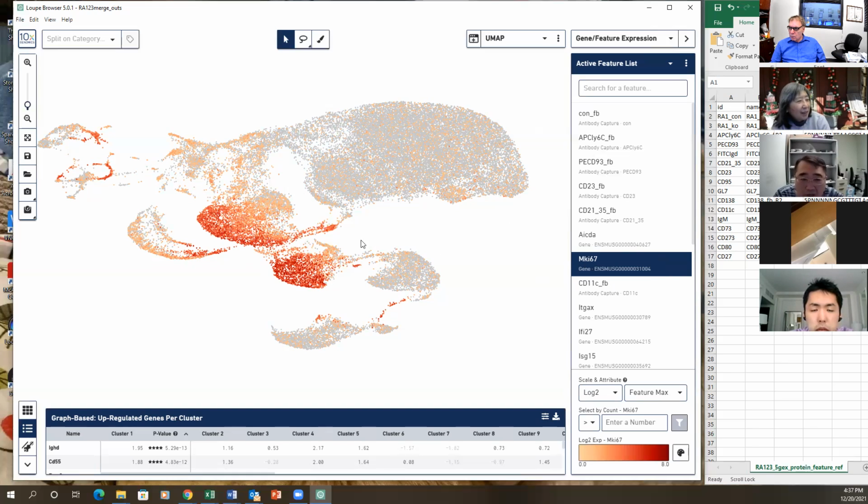It's 700, I think still less than 1,000. For FO, almost everything is still more than 1,000. So for FO, we don't see the difference. Almost all samples are the same.